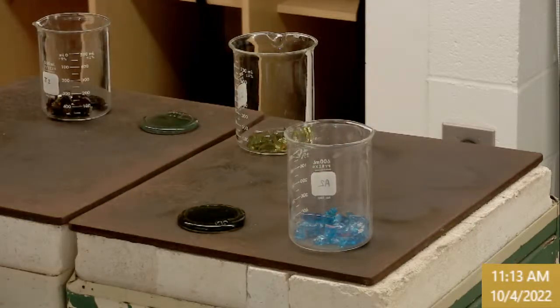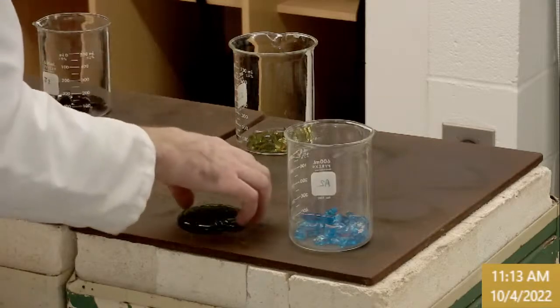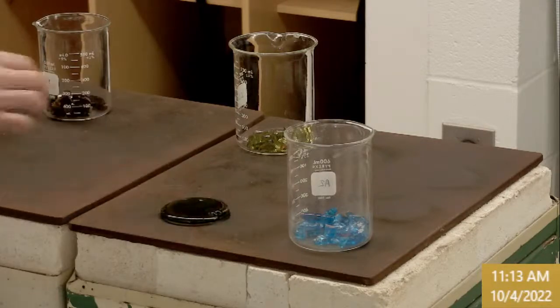What's on the light table can still shatter partially unexpectedly, so still wear your safety glasses and goggles and be careful. Still sharp hazards. I'll probably do a little bit of filing quick on that one that has sharp edges.